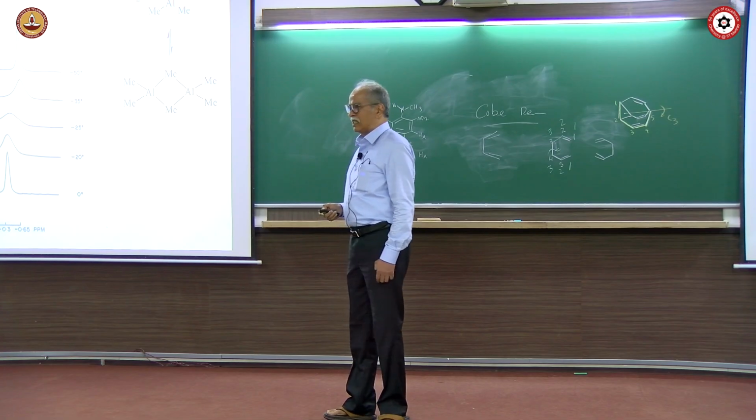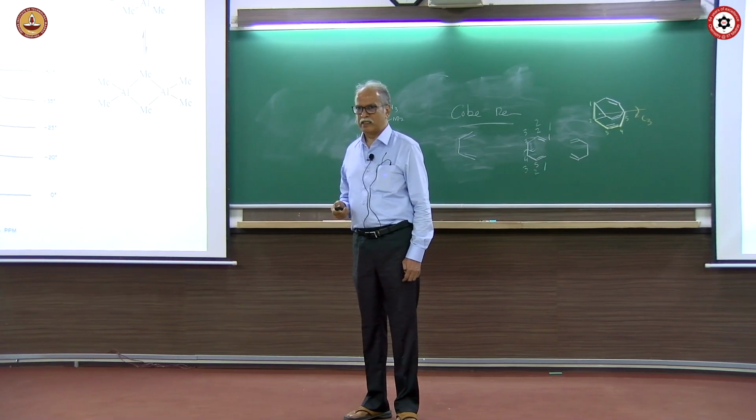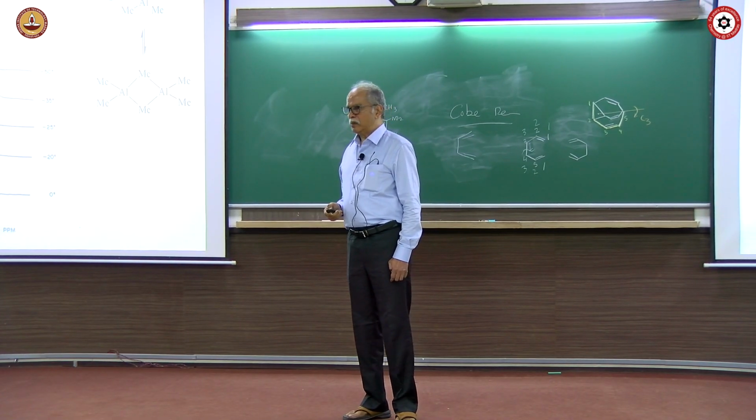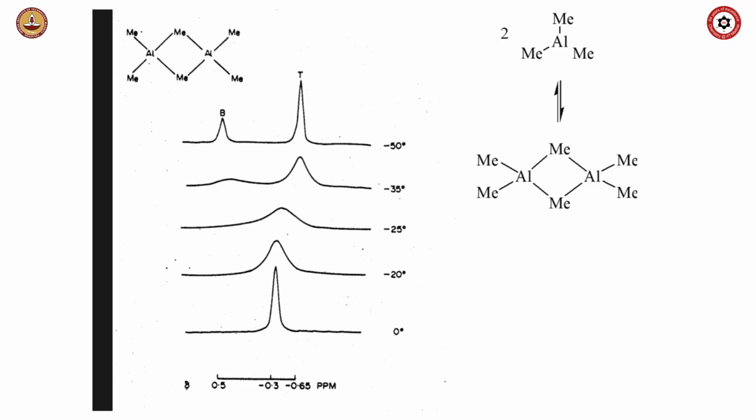Trimethyl aluminium is a pyrophoric compound. Pyrophoric compound means it will spontaneously catch fire under atmospheric conditions. It can be handled under nitrogen or argon conditions, and you can study the dimerization of aluminum. This is a bridged methyl system. This is a terminal methyl system. Bridge methyl is abbreviated by B, terminal methyl is abbreviated by T, BT, bridge and terminal.